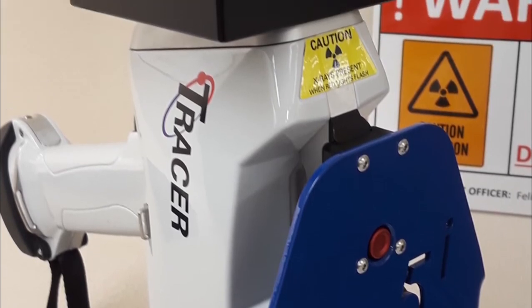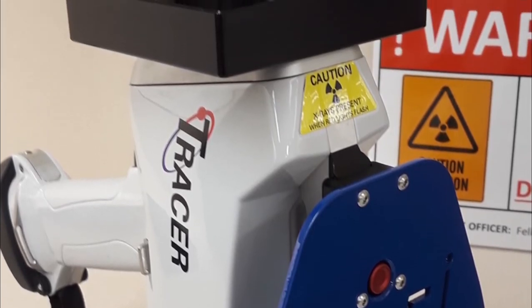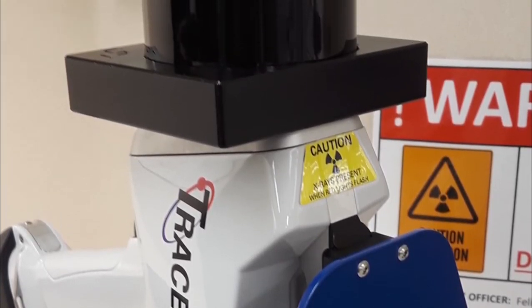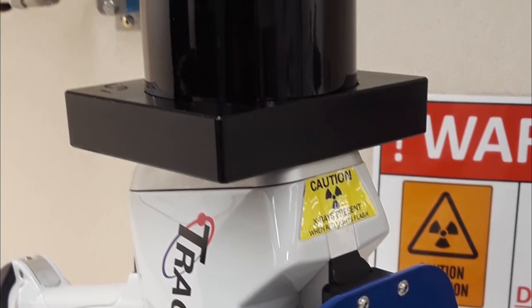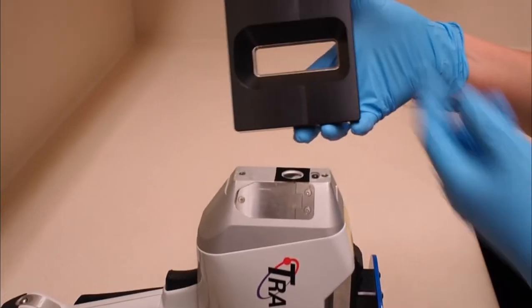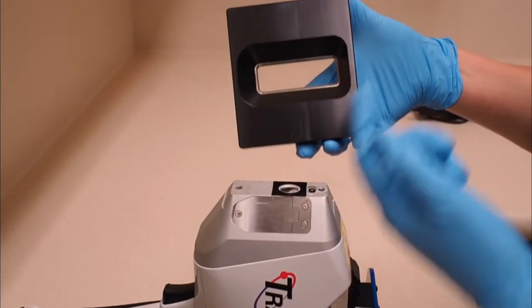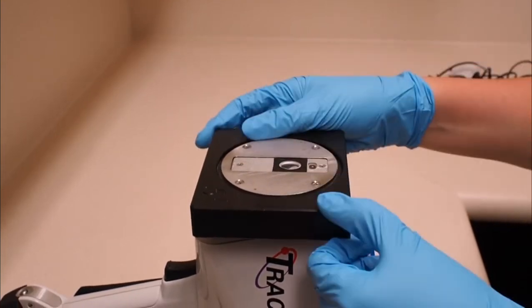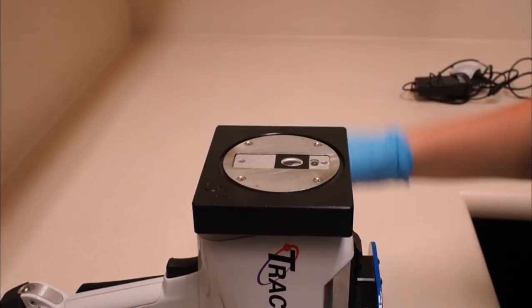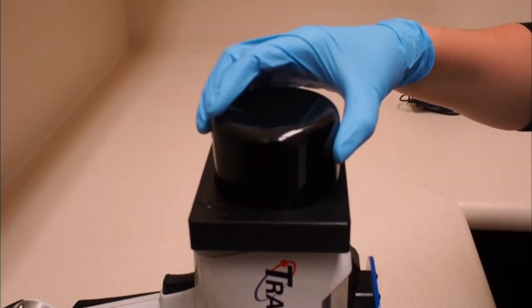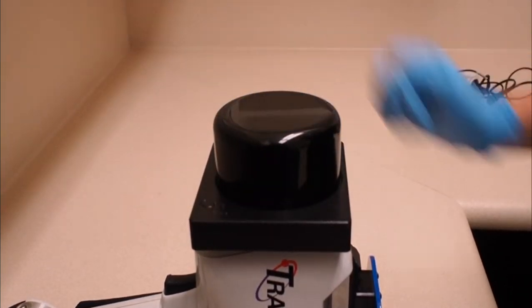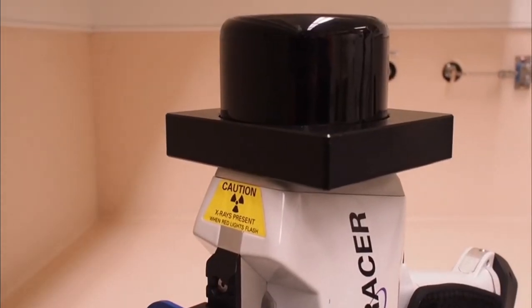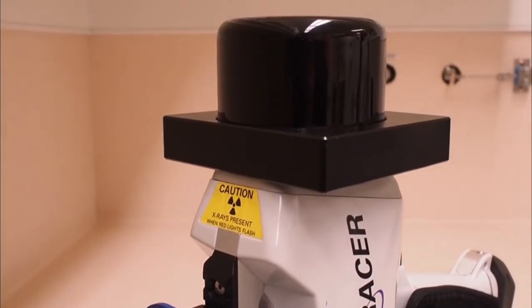If appropriate for your sample, you can also use the sample stage. This fits over the top of the instrument window and can only go on one way. The radiation shield should be placed over the stage if possible to provide shielding from the emitted ionizing radiation.